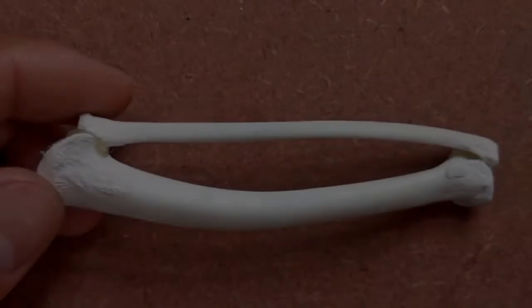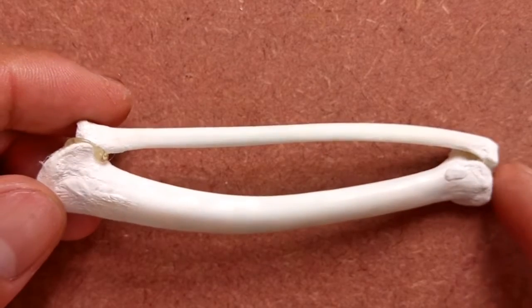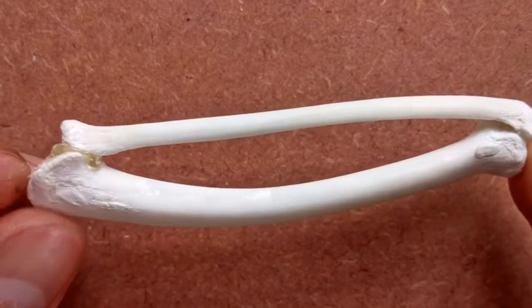Once we're done with that, we move on to the radius and ulna. This is how the articulated radio-ulna looks like.